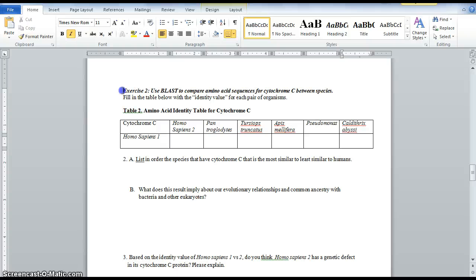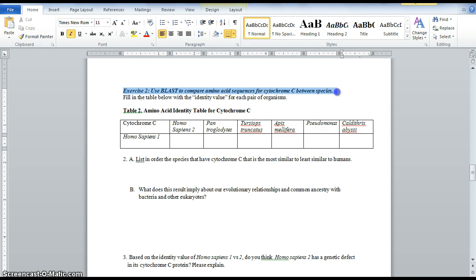Now we're going to look at exercise two, which is to use BLAST to compare amino acid sequences for cytochrome C between species.